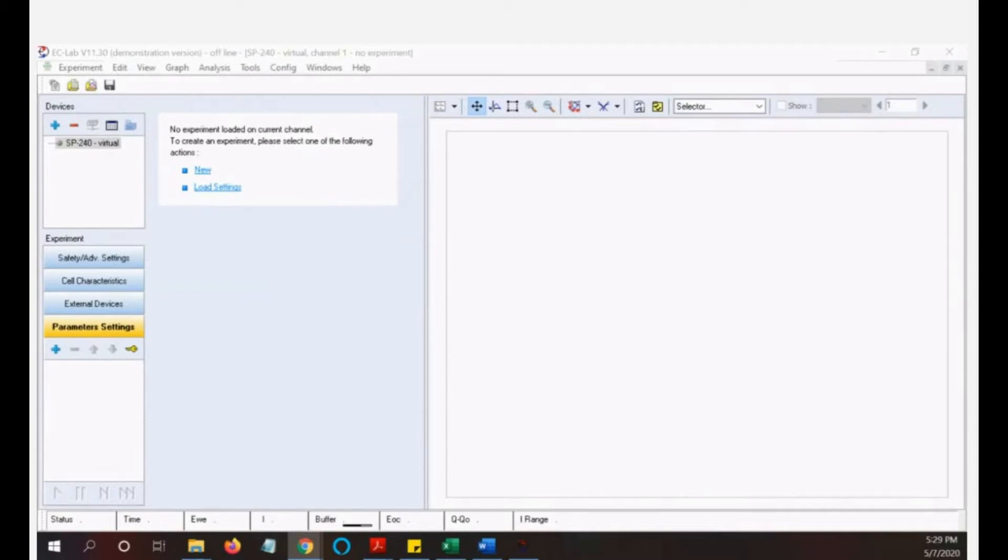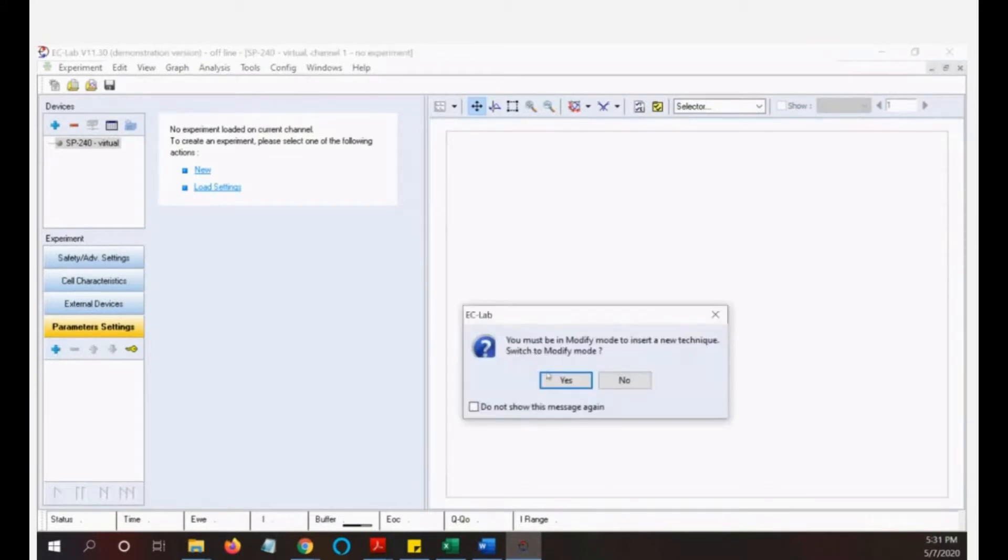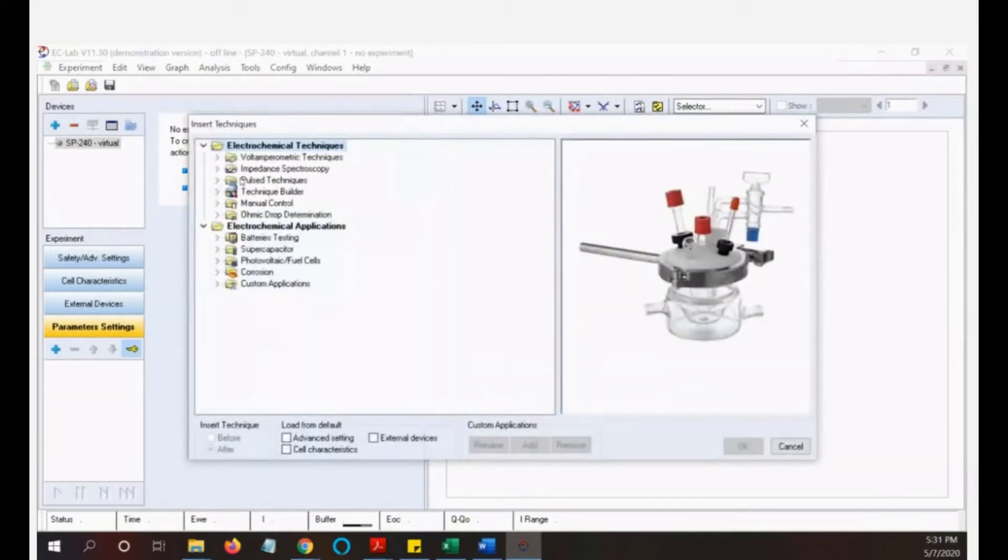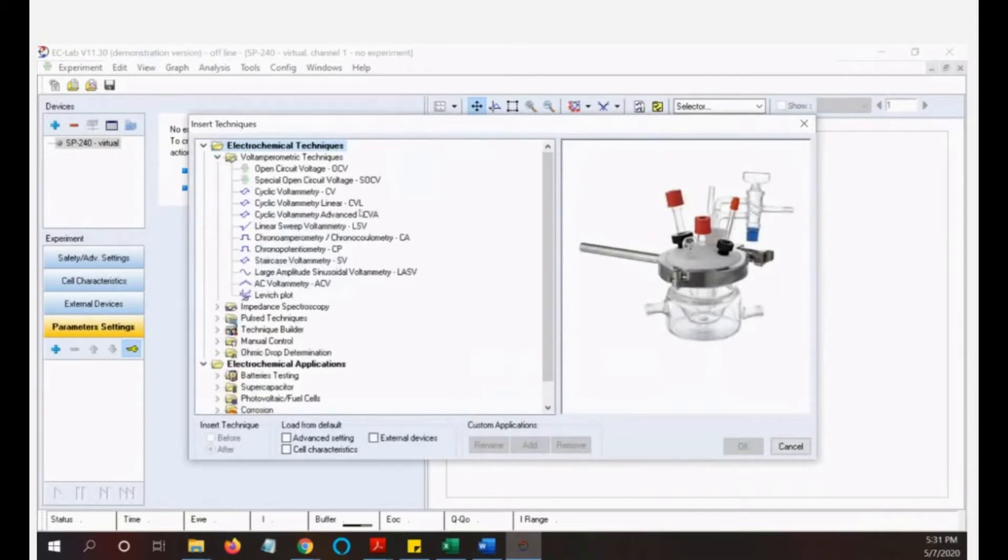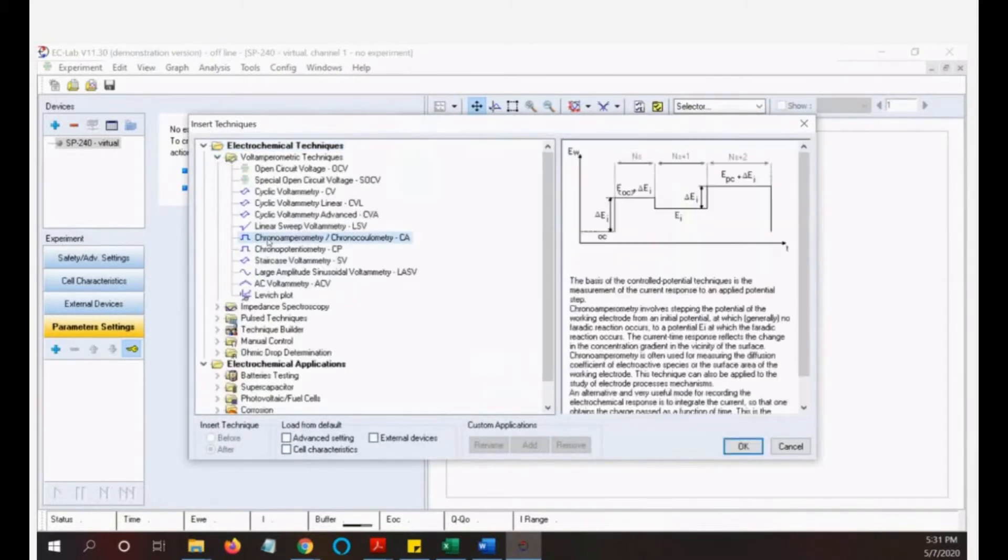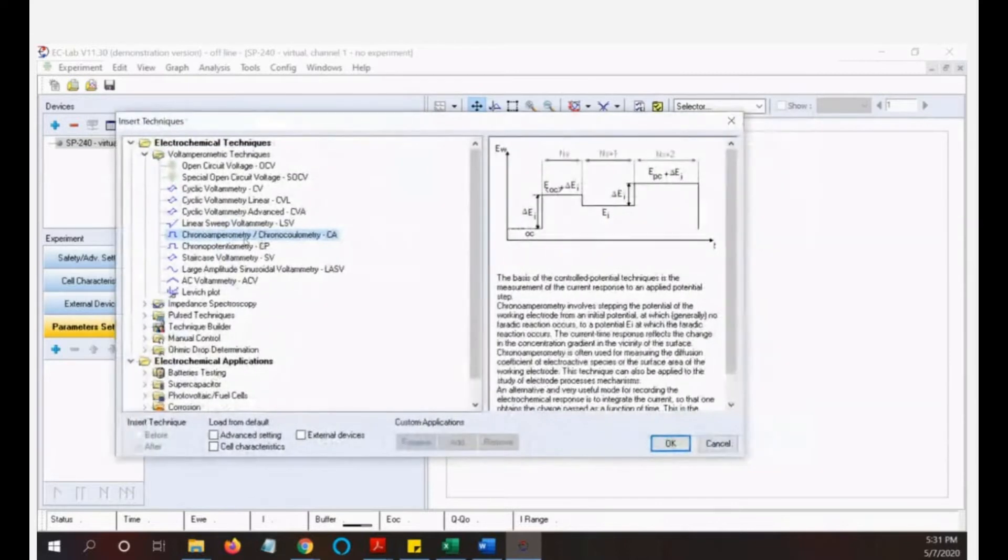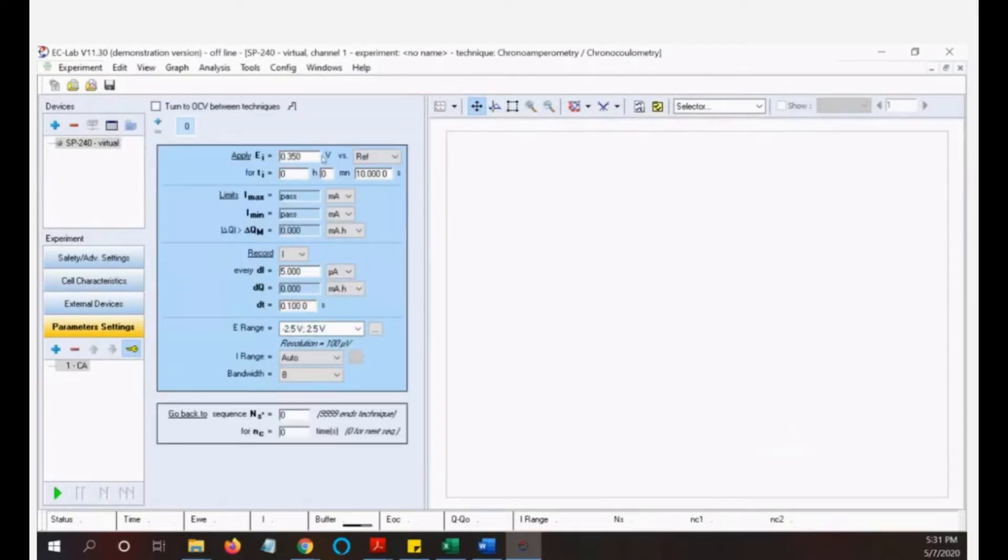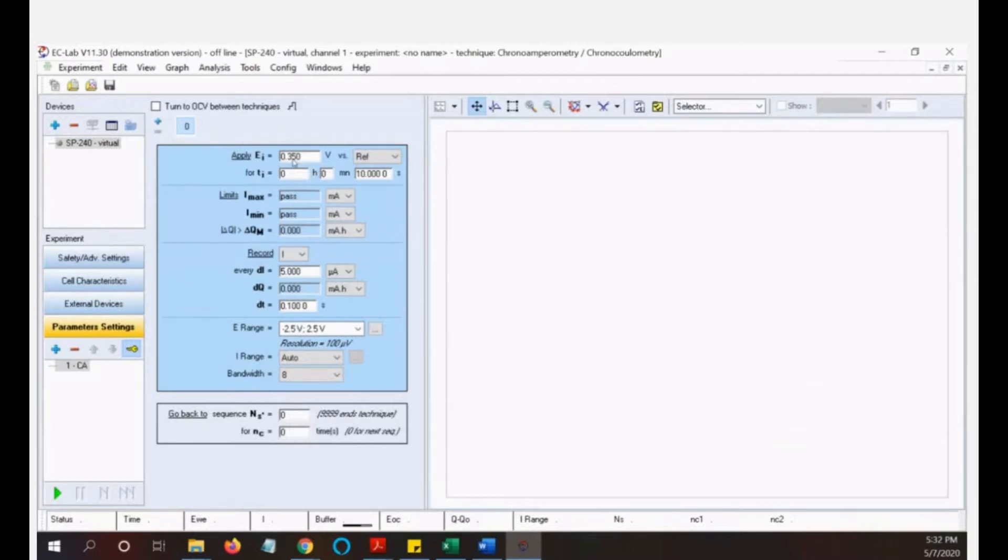So today this is about surface area determination and the setting in chronoamperometry will look like this. This is a chronoamperometry, so you just click OK and then we will put the voltage.